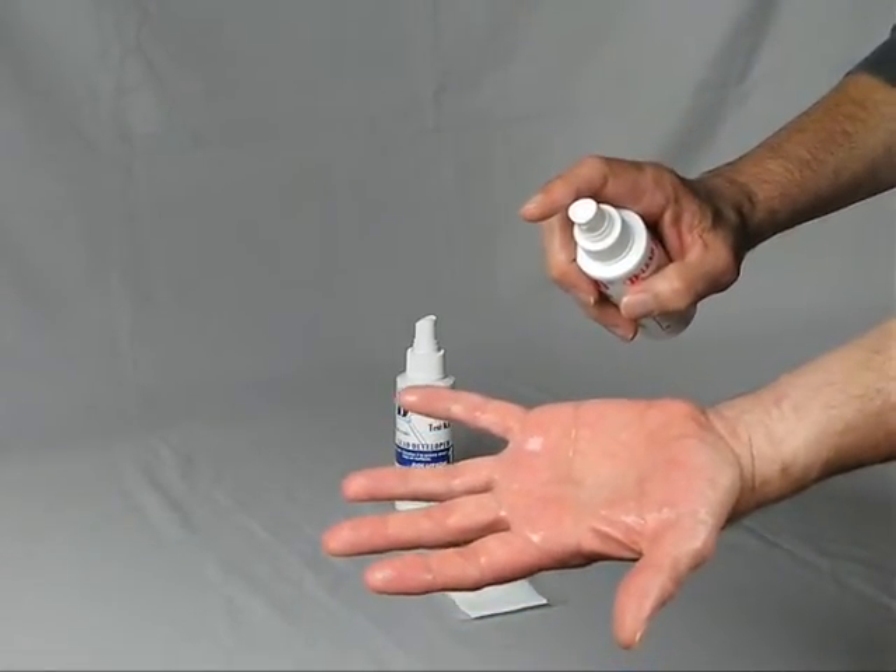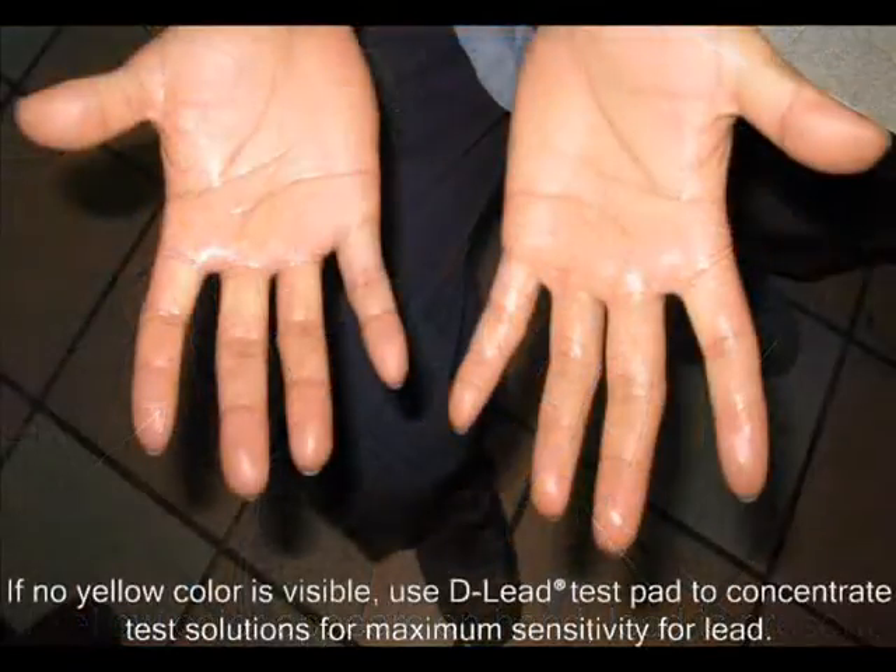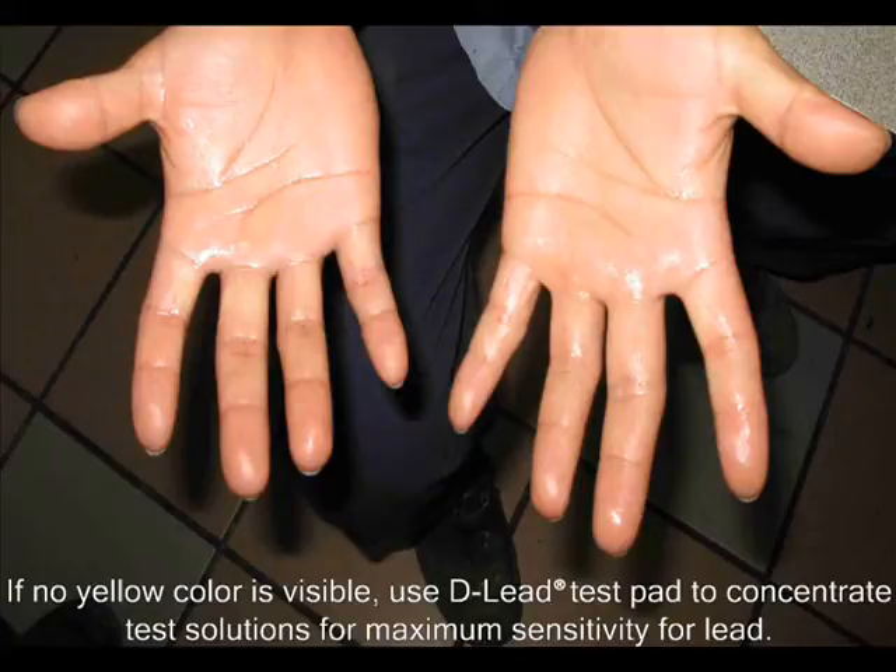If lead is present, an immediate color change to yellow will show the exact location of the lead on your hand. If no yellow color can be seen, proceed with using the D-Lead Test Pad to concentrate the solutions.